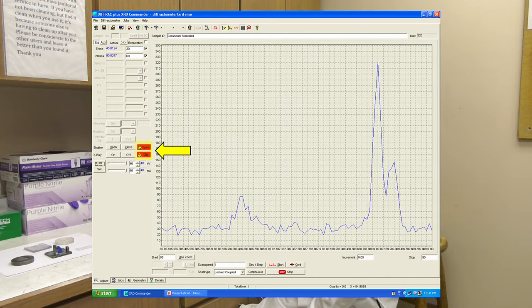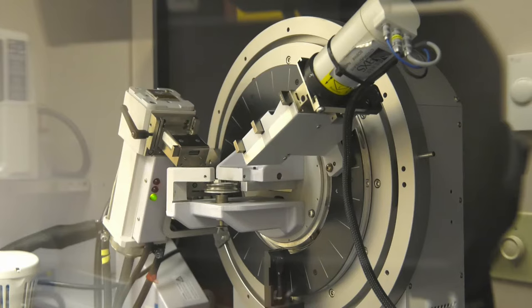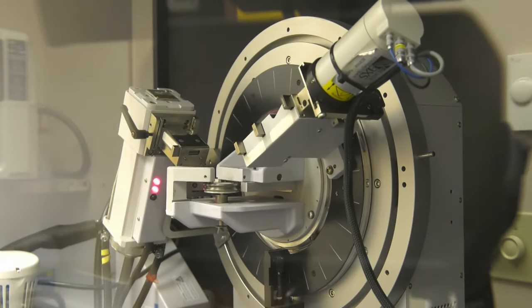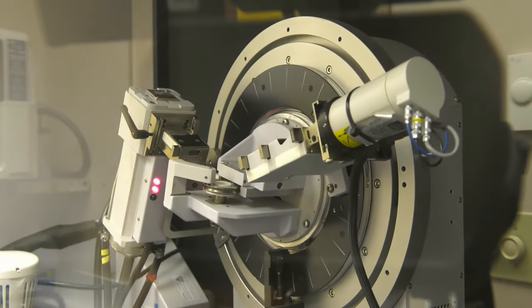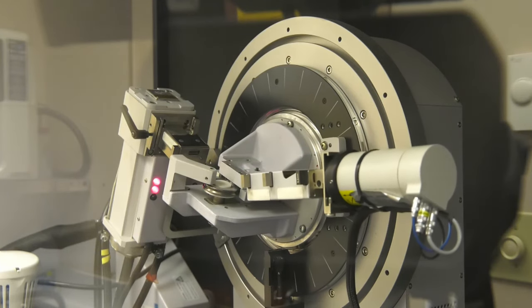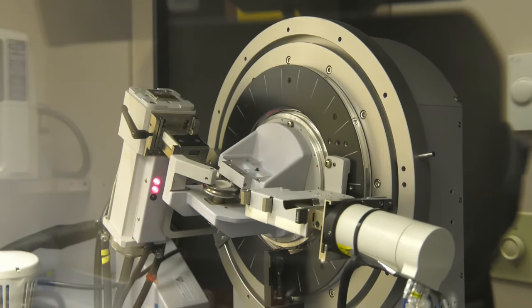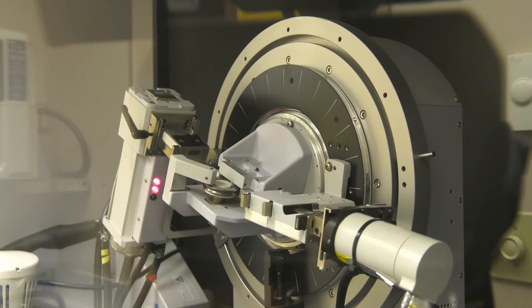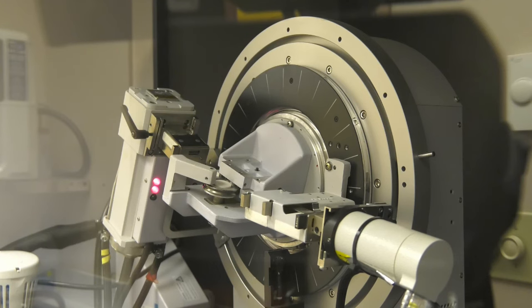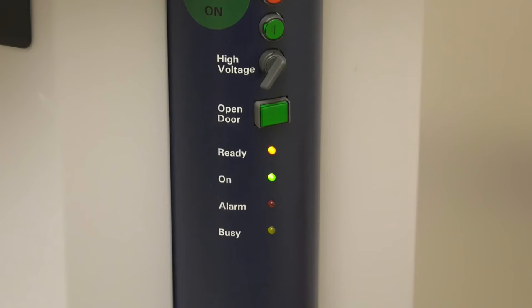This will open the shutter of the X-ray generator and begin the scan. Two red lights are illuminated on the X-ray generator when the shutter is open, and the goniometer moves into its starting theta and 2 theta positions. This goniometer has a stationary X-ray source with moving sample stage and detector, but other XRD instruments may have a stationary sample stage with moving X-ray source and detector. During a scan, the busy light will be illuminated.